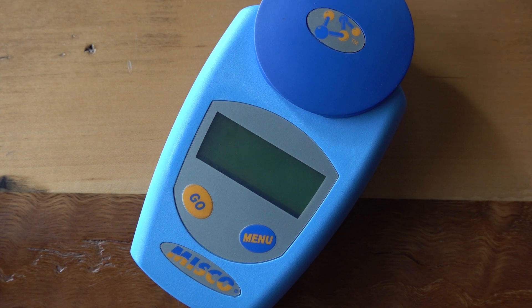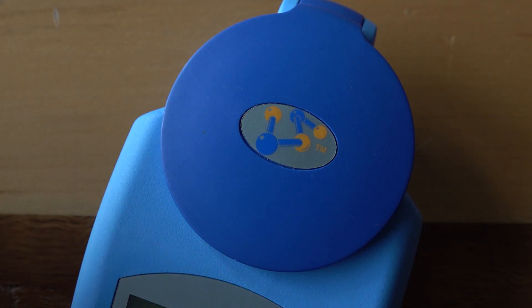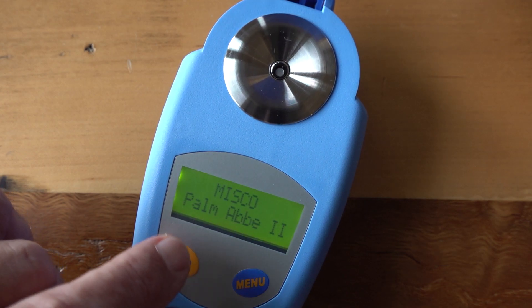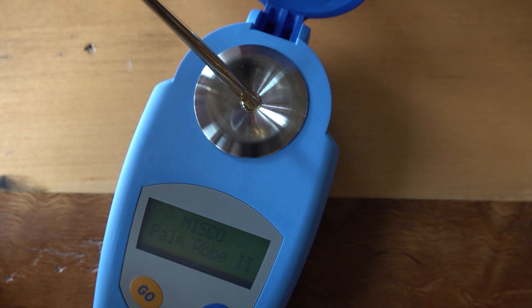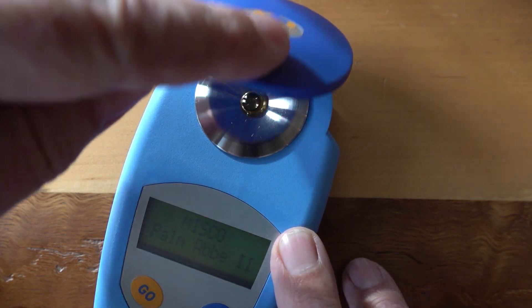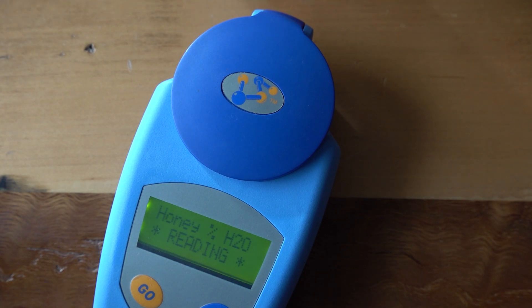Let's compare this reading with a MISCO refractometer. For me this is the best refractometer I could find anywhere — I've used it for years. This is what state inspectors and food inspectors use. This one tests one thing only: honey water percentage. It also has a little cap that covers the dish, which sets a constant temperature to ensure the reading is true. I'm going to put the exact same honey — also at the same temperature — on the MISCO. Thank you, Brian, from Castle Hives.